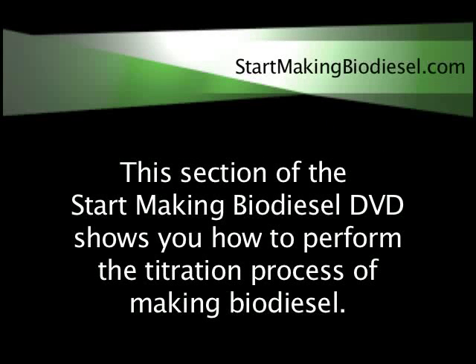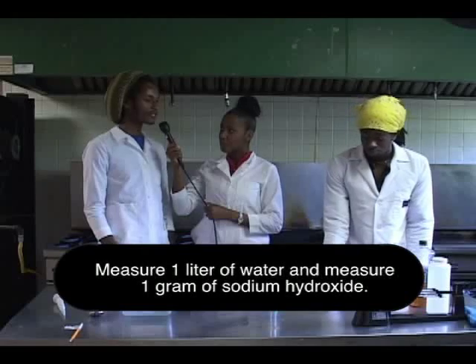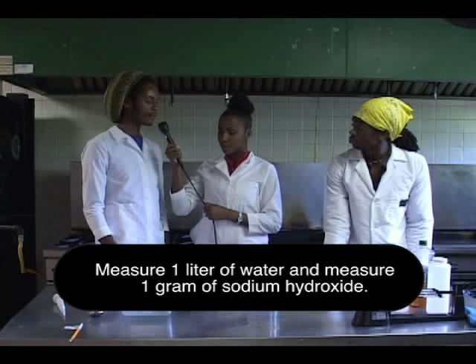This section of the Start Making Biodiesel DVD shows you how to perform the titration process of making biodiesel. The first step is doing the titration, and that's to determine the free fatty acid content of your vegetable oil.